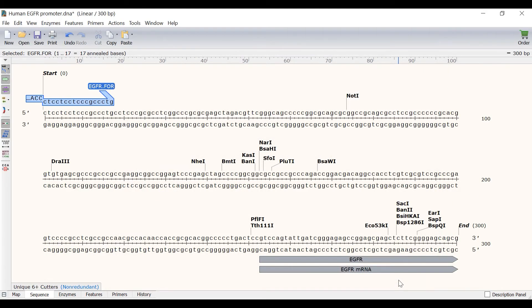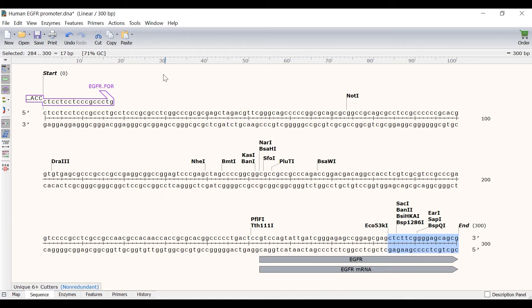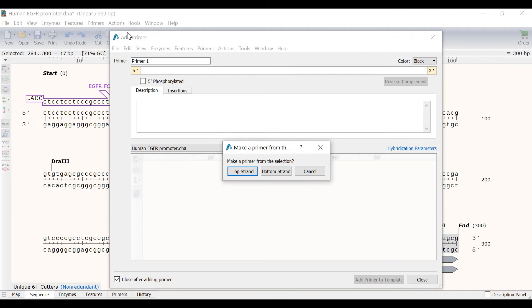I will now do a similar process to add the XHO1 site to the end of the sequence. Again I will click and drag on the sequence to select the bases that give me a melting temperature of approximately 60 degrees Celsius. In this case this is 17 bases. Then I will go to Primers, Add Primer.